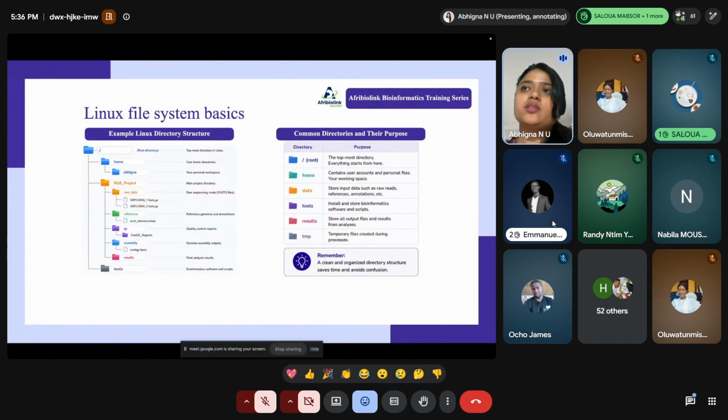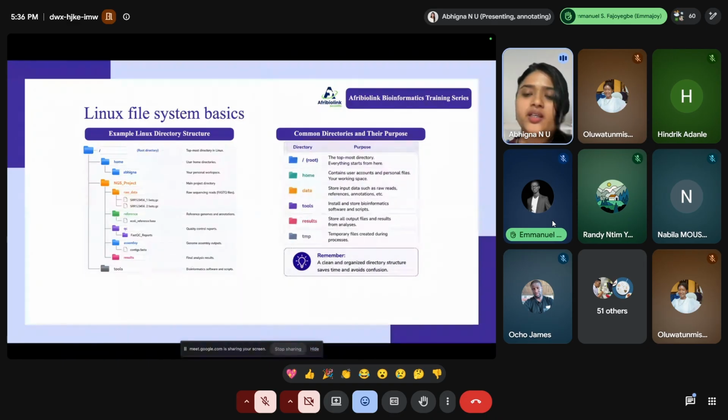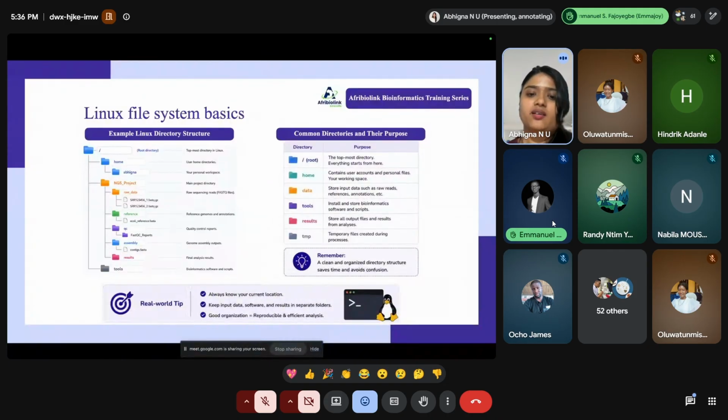So when you are working with large sequence data, always keep your organization clean, so that when you revisit, you don't forget the architecture of your folders and keep searching for the file that you have kept somewhere. Always know where your file is and how it is stored. A simple idea is to store it in very specific directories.